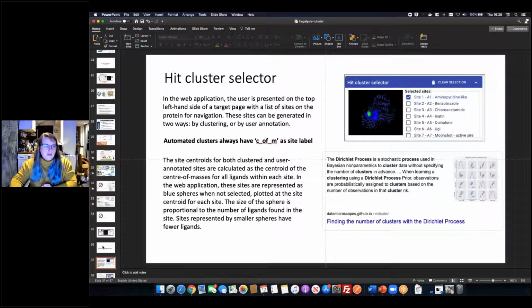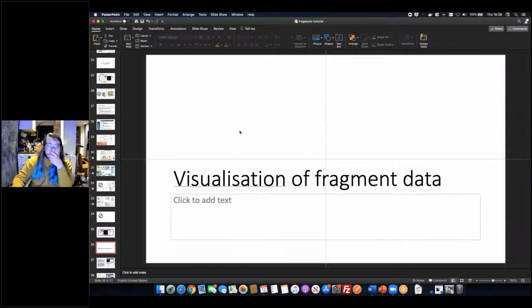Yeah, absolutely. So one of them's rather more technical for the crystallographers. How do you cryoprotect your crystals in the workflow? I don't know. You would have to ask the beamline scientists. All of the information is available if you Google fragment screening XChem. Our fragment screening pages have all of the details of exactly how they do the experiments.